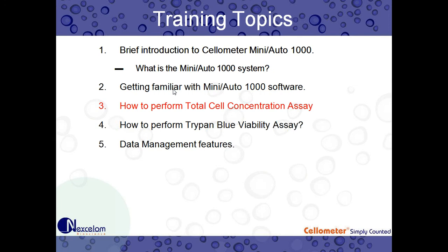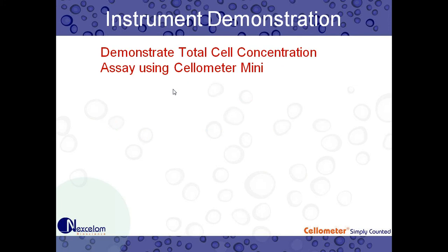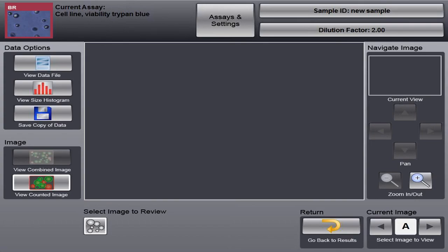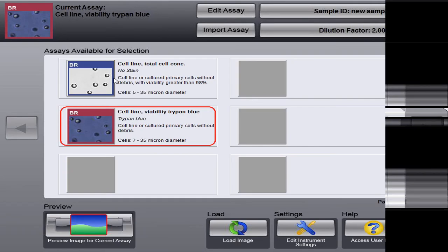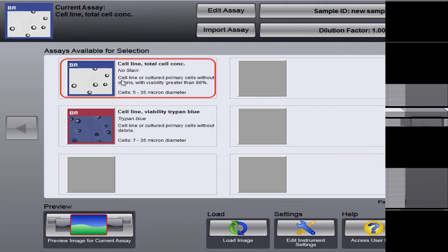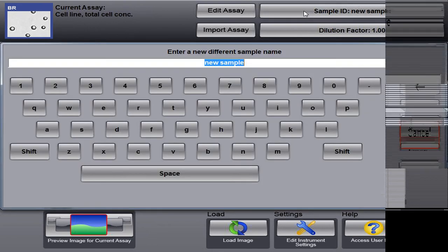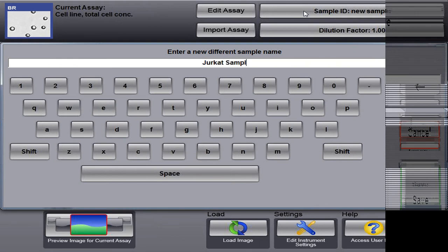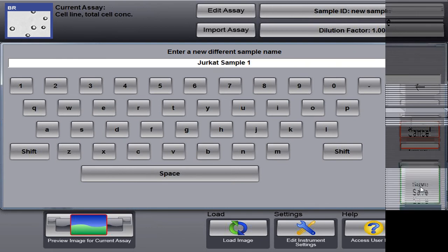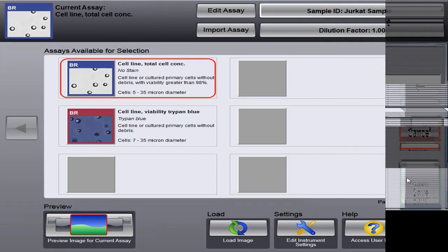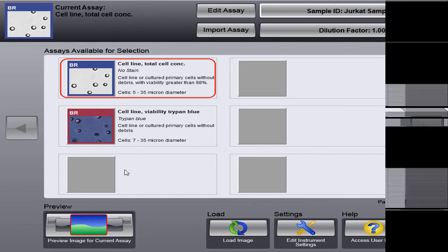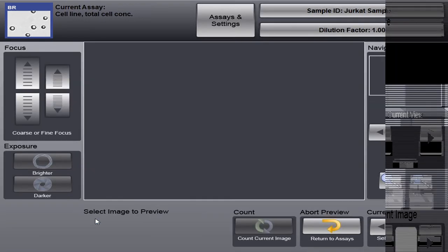So now we're going to go into our total cell concentration assay. So I'm just going to switch over to our Mini software. So here, we'll go back to our home screen. And this is a live demo. So we have a slide here with Jurkat cells on it, an immortalized cell line. So I've already put the cell sample, the 20 microliters, onto the slide. And the slide's in the instrument. So I'm going to select our total cell concentration. These are not stained with Trypan Blue. I'm going to enter in our sample ID. So we'll do Jurkat sample 1 and click save. We have a dilution factor of 1 because there were no dilutions done for the sample. And I'm going to hit preview.